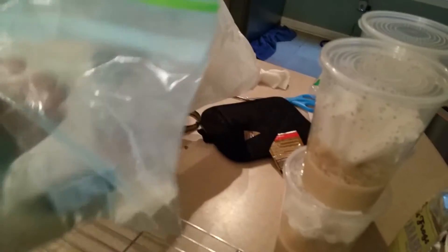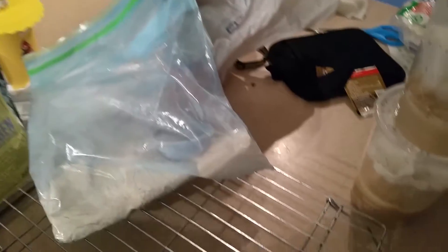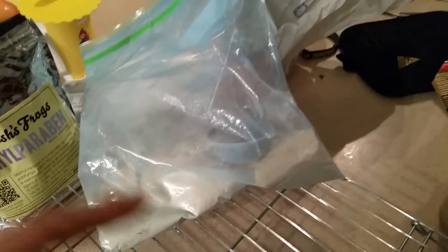Here's the media I use — I need to make some more soon. It's pretty much just potatoes, cinnamon, brewer's yeast, and powdered sugar — a very basic recipe. I also have methylparaben mold inhibitor from Josh's Frogs mixed in, but whenever I make my cultures I still sprinkle a little bit on top.